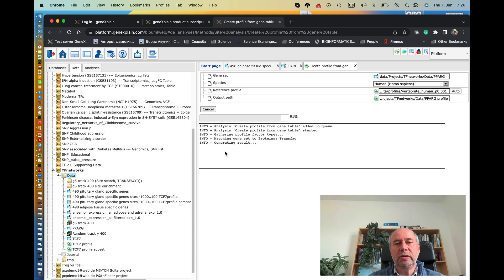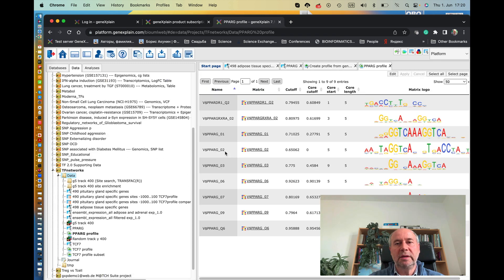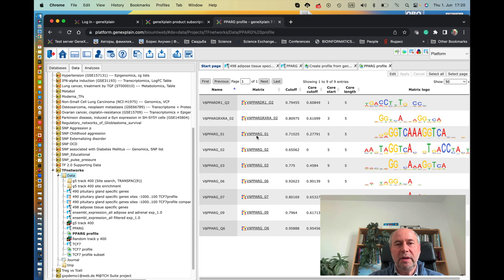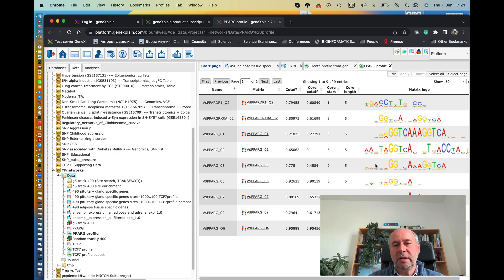So now it goes to the TransFac, selects those positional weight matrices, the motifs for PPAR gamma, and you see here nine matrices, nine positional weight matrices which are associated with PPAR gamma transcription factor.